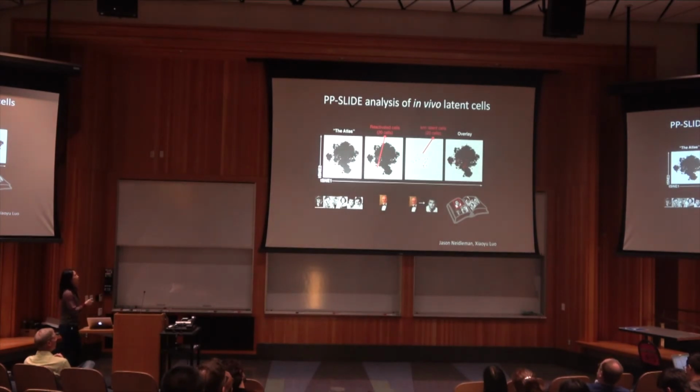First I show what we established, an atlas of all the different types of unstimulated CD4 T cells in that participant. These are actually memory CD4 T cells. We purified the memory CD4 T cells ahead of time to further enrich for the reservoir, because it's thought to be enriched in this population of cells. In the second plot, I show where the reactivated cells fall within this atlas. It's actually 20 cells all on top of one another. Maybe it's hard to see, but it's basically this red dot here.